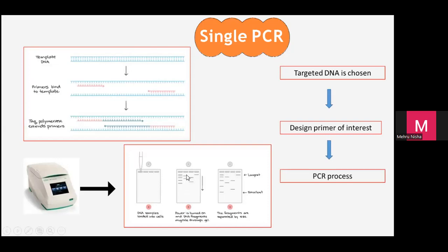Kalau size DNA amplicon kita just beberapa ratus base pair, dia akan cepat lari. Dia kan smallest. Tapi kalau dia besar, genomic dia besar, dia tak boleh gerak di gel ni. Jadi dia akan slow, dia akan berhenti di sini. Usually this is a large base pair lah, macam 1 KB, 1000 KB ke 2000 KB and so on. Okay. This is the one which we know.